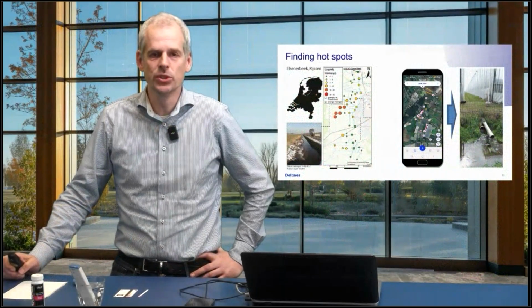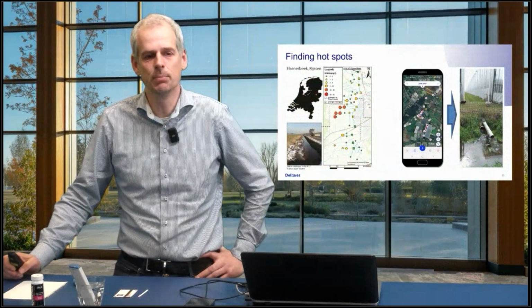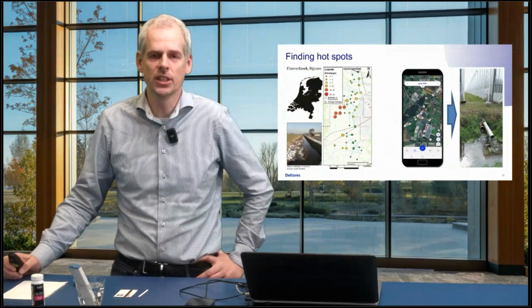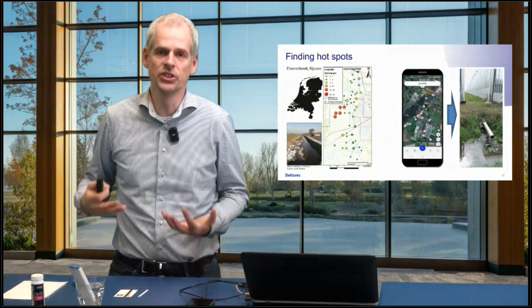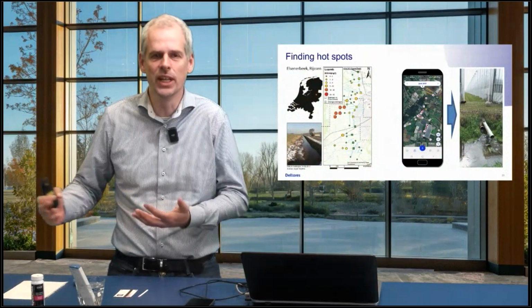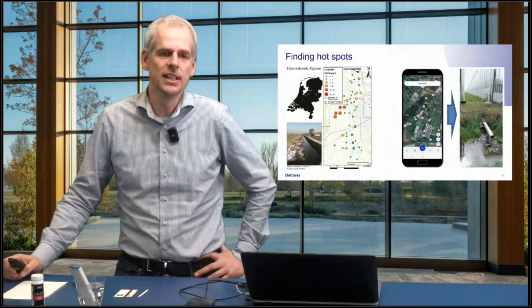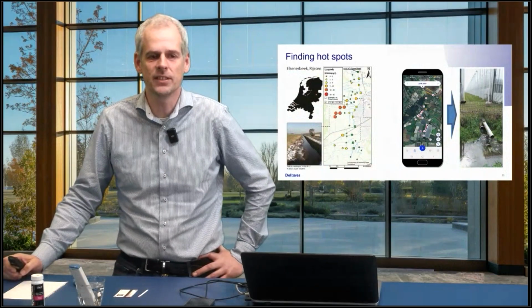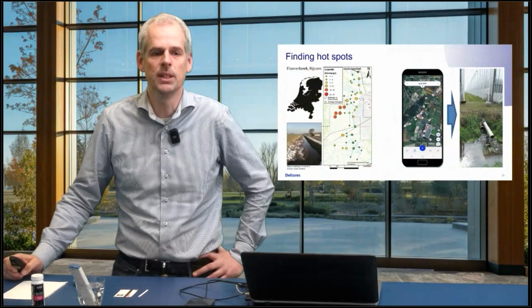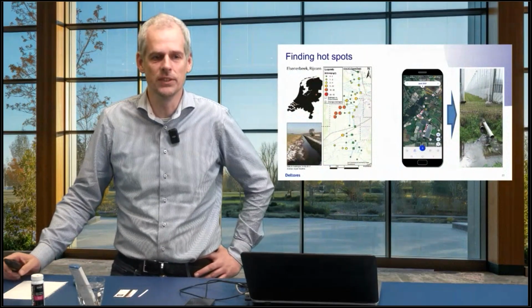So it has been used like that by a couple of water boards in the Netherlands. The picture on the right is an example where they found some high concentration values, and they started looking. The nice thing is that you get your results instantly, so you can take your decision in the field where to go next and where to find the source. In this case, there was a glass house with a spill that could easily be removed, because he could also drain this water to a sewage system. So this is one of the examples where we actually made some improvement to the water quality in this area.